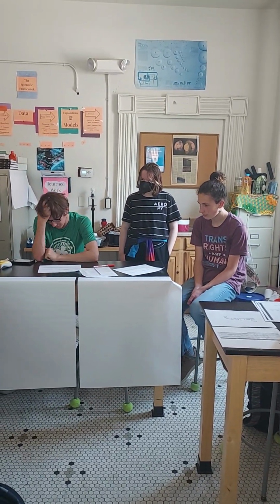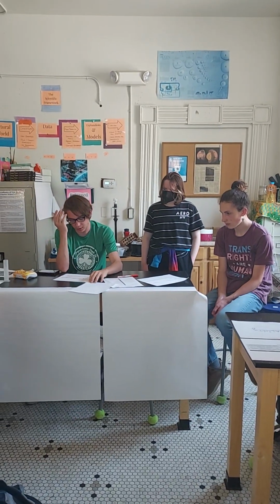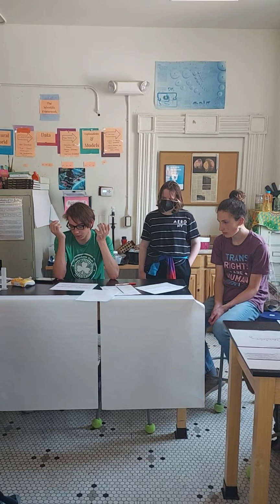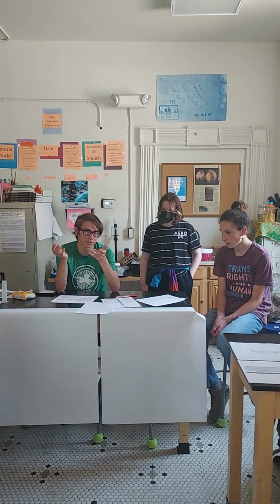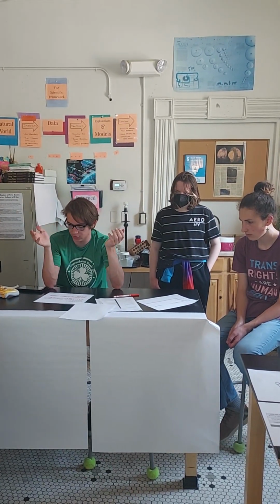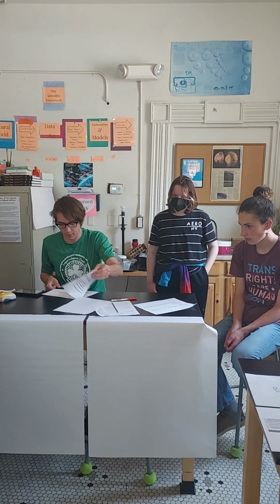The water from Cascadilla Creek is healthy but at risk and in need of monitoring and improvement. Here's why. First of all, the phosphate was measured at 0.25 parts per million, which means it is in a healthy range, not at risk of eutrophication due to phosphate, but it may need some monitoring because it is somewhat close to the point of eutrophication. And nitrate, we measured anywhere between 0 and 5 parts per million, which is a healthy range and is not at risk of eutrophication.